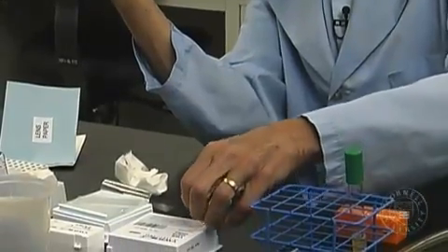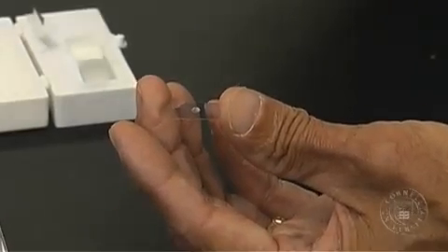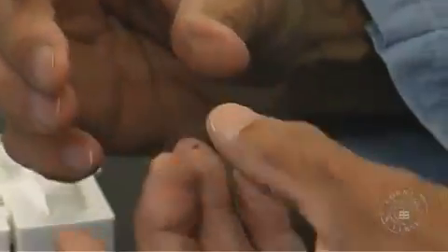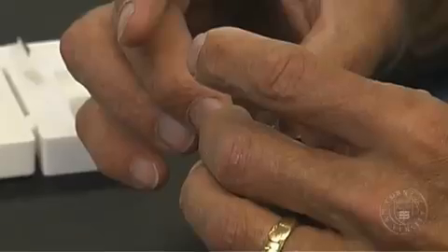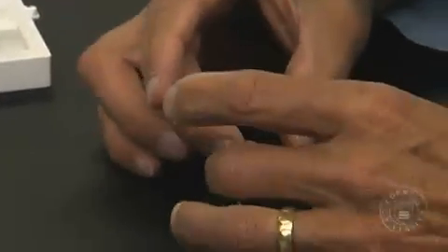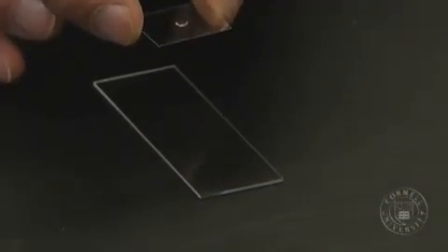Take my cover slip. I will dispense 5 microliters to the center of that cover slip. I do it this way on the cover slip for a very special reason. When I mount this on the glass slide, I would like an air bubble to form, and this is actually the best way I know to get an air bubble. It doesn't always work, but it works most of the time.